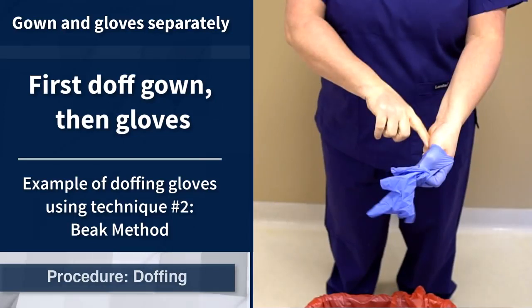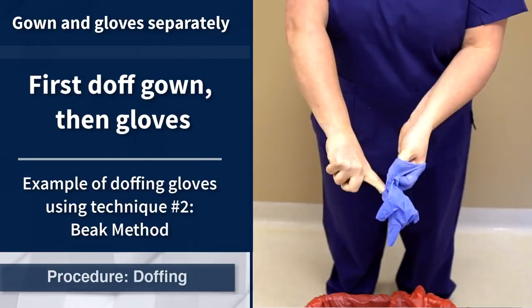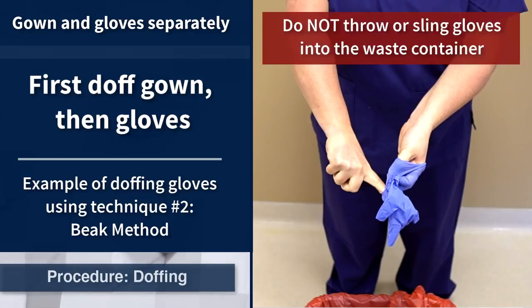Slide the index finger of the ungloved hand into the inside of the glove and slide it off. After the gloves are removed, dispose of them safely. Do not throw or sling gloves into the trash.